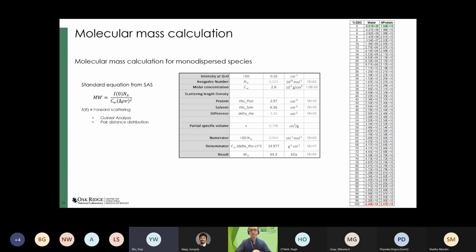Yeah, I'm not quite sure. It has been consistent since our previous SANS experiments, our most recent ones, and the molecular weight is consistently about half of what we expected for a monomer species. The molecular weight calculated from Guinier is just half of that, and we were really confused why that happened. I think we'd have to have a look at your data, Yuki, to see.